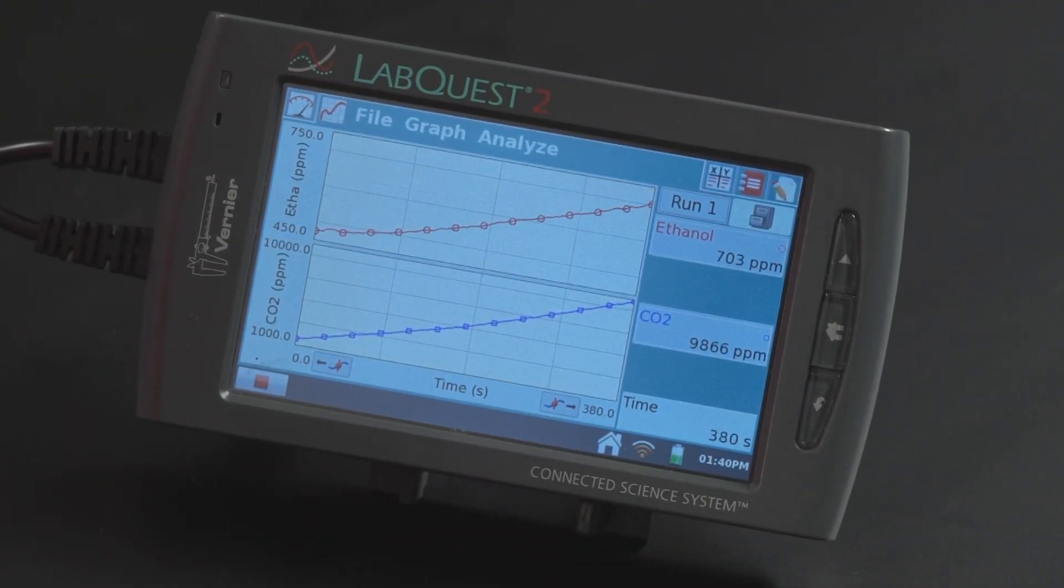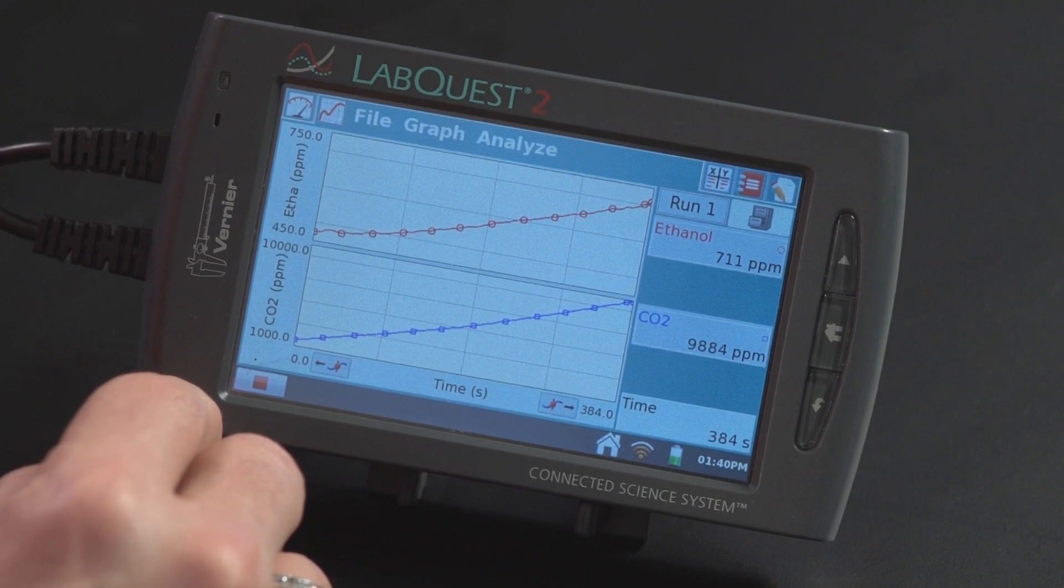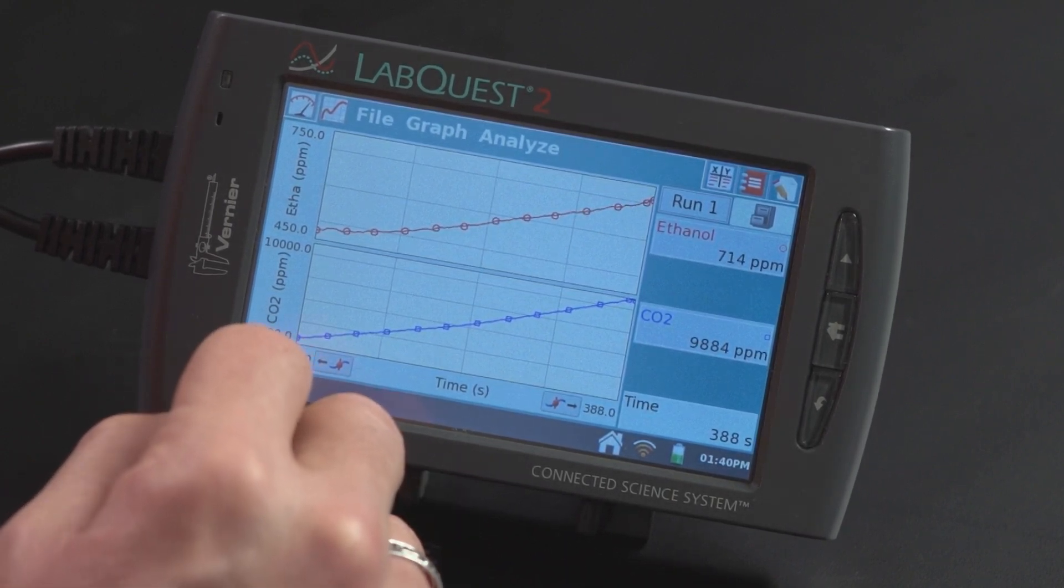So you can see right now it's been about just over 5 minutes. And we're getting to the maximum amount that the CO2 sensor can take, which at the low setting is about 10,000 PPM. So I'm going to stop it.